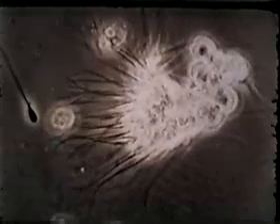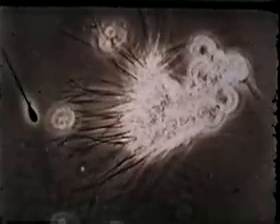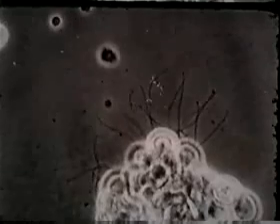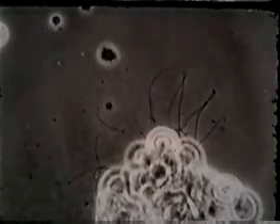Sperm in the seminiferous tubules occur in groups with their heads embedded in Sertoli cells. All sperm in this segment show a slight vibratory or undulatory movement. Occasionally, the tips of the flagella appear to be blebbed. The significance of these blebs is unknown.